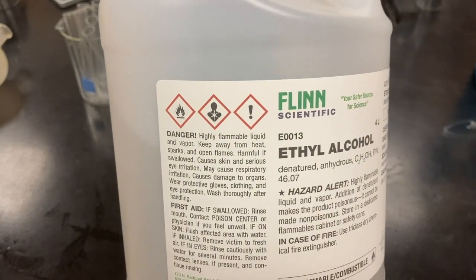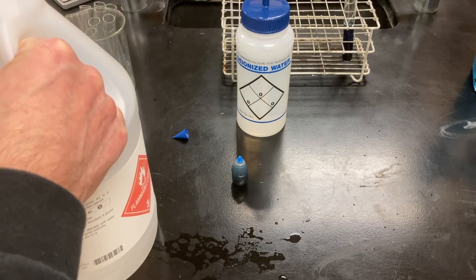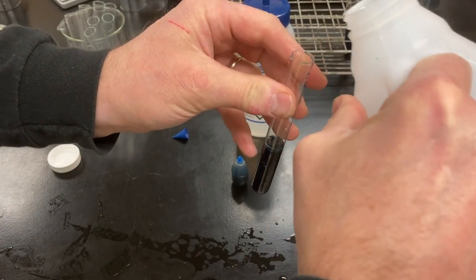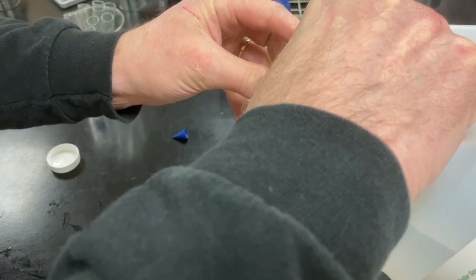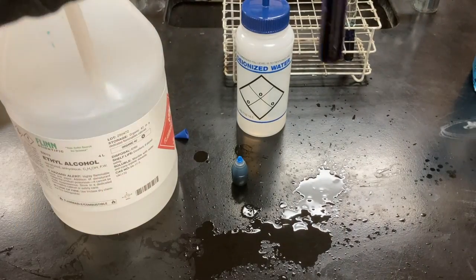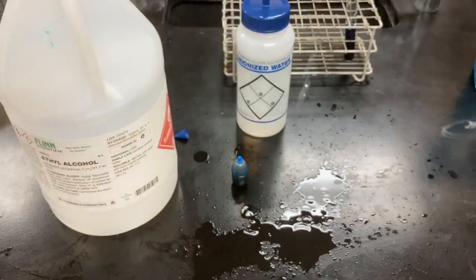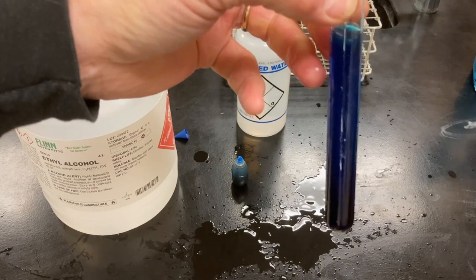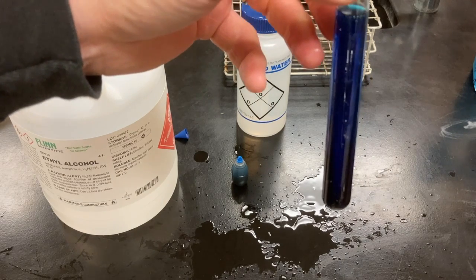Now I'm going to put ethyl alcohol, or ethanol, in the test tube. And you can see at first it looks like they're not quite mixed together, but if I shake it just a couple of times, it becomes like one continuous looking substance.